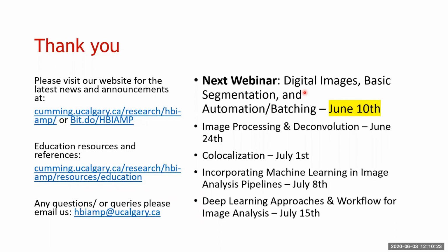Basically, the more contrast you have between your structure and your background will depend initially on your sample prep. If your signal is very bright versus whatever else, say your tissue autofluorescence or whatever media your cells are in, then this is likely to lead to a higher contrast in your image.